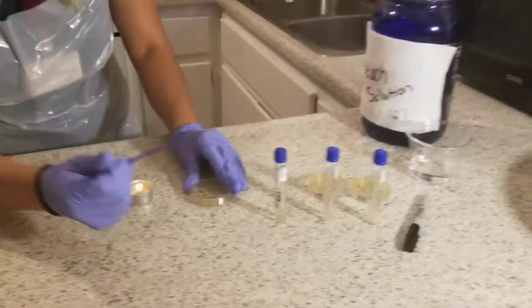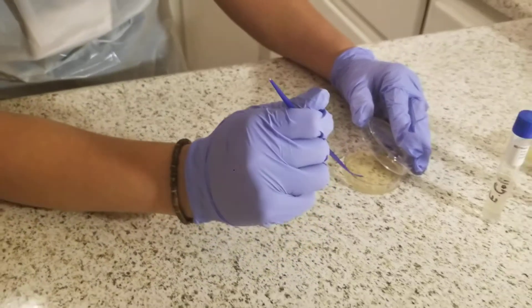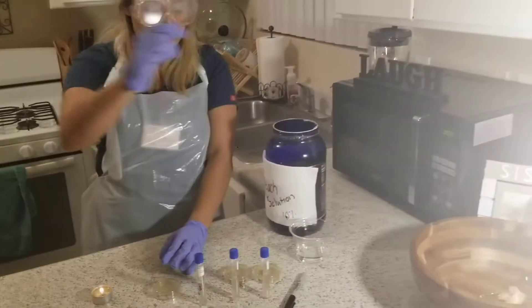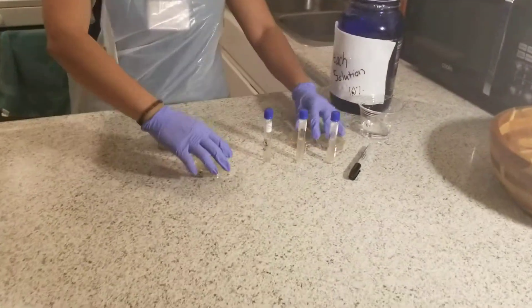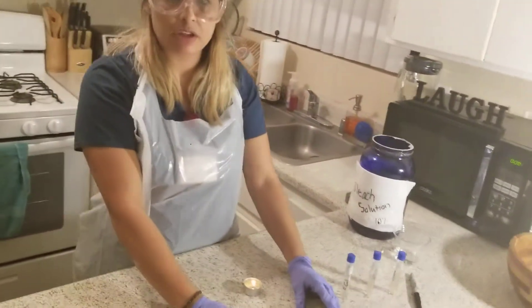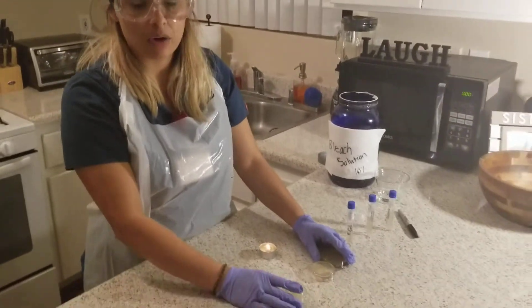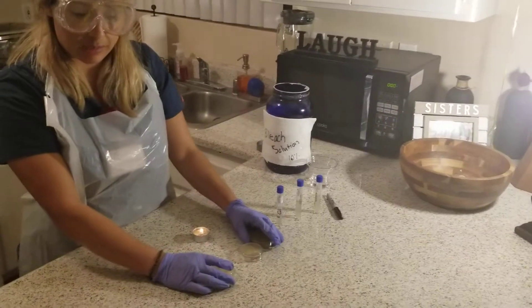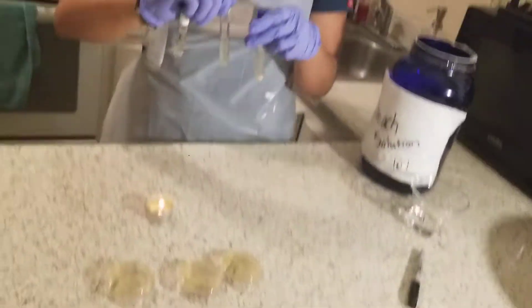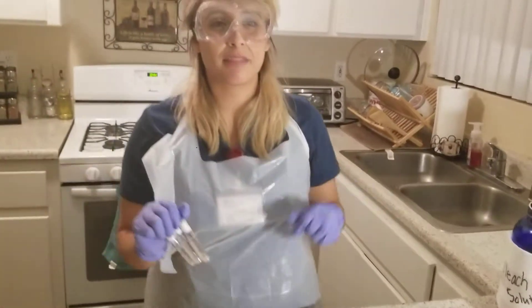So this is the last one. And then this will be going into the 10% bleach. Then with the three plates, I will be placing them in my incubation location for a period of 48 hours. From there I should be able to see the microbial growth for my broth. I will be placing them in the refrigerator for any future experiments. And that's all. Thank you.